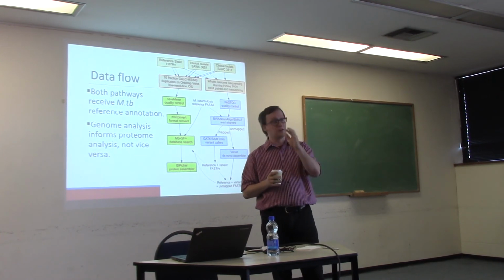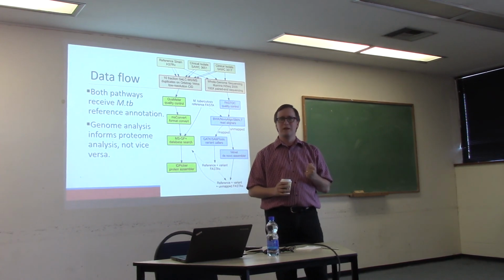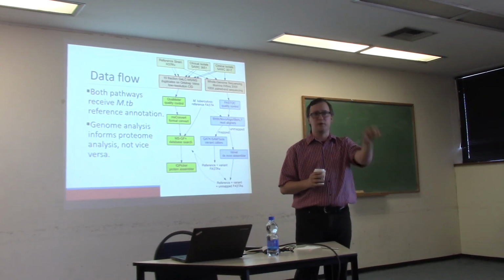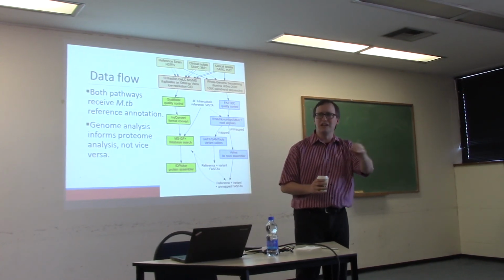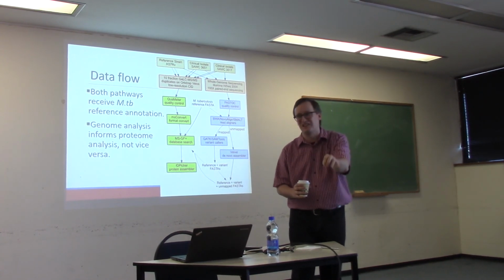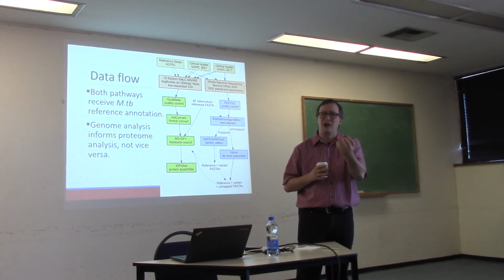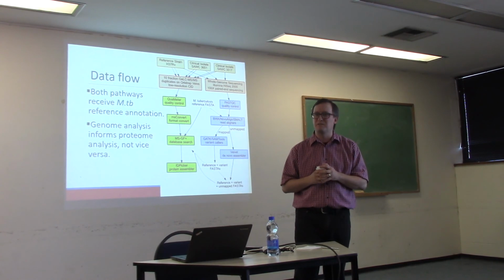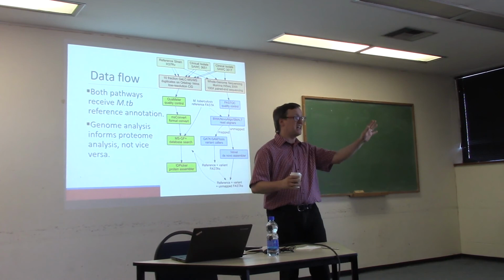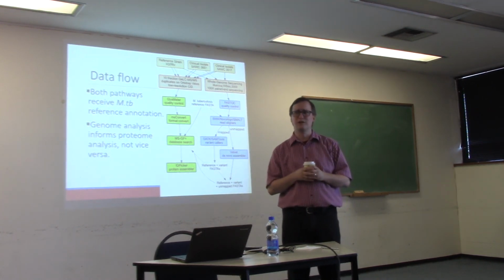There are lots of arguments for this. There are lots of people who will tell you there's lots of gold there and we need to just dig into that and figure out what it is. But in fact, what we see is that our instruments are so good at producing tandem mass spectra, just pouncing on any peptide that's showing up, that frequently they're digging into a very, very sparse signal to try to produce those fragment ions. And you have so little signal caught in the trap for producing this tandem mass spectrum that you simply don't get a very good signal-to-noise ratio. And if it's all just static, your matching is going to match it to whatever it can, but it's all going to be with a very low score.